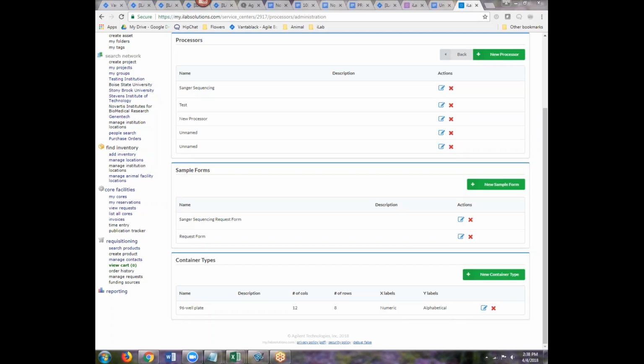Okay. So does that make sense? Yeah, that sounds like what they've been talking about in genomics. Okay, genomics. Is that Deb Grove's core or her former core by any chance, or is that a different one? No, Craig Pearl is in charge of it.